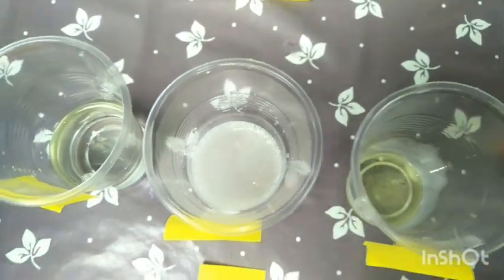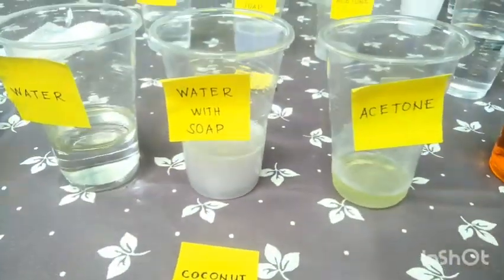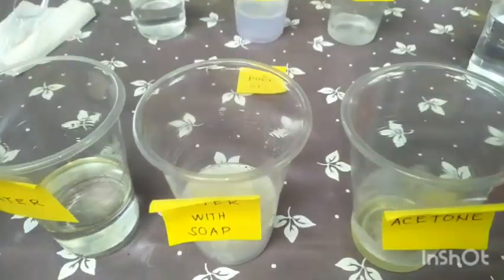As you can see, the coconut oil is insoluble in both water and water with soap, while it is soluble in acetone.